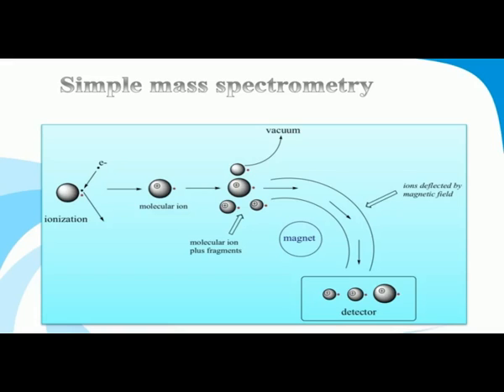For setting the direction of the molecular ion. For direction of the molecular ion, it still does not break. The molecular ion is further not broken by passing through this direction. It only gets a direction from where it passes.